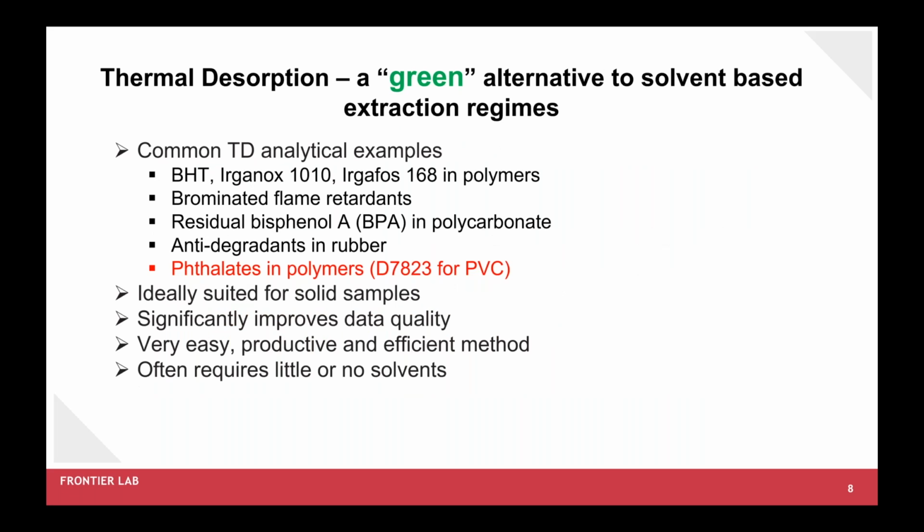So as we just mentioned, the traditional techniques require a large amount of solvent and excessive analyst time, and can be prone to contamination and other errors. The result of this additional sample handling can reduce laboratory productivity, and the information obtained could exhibit poor precision and accuracy in most cases.